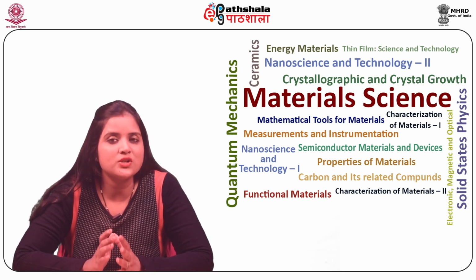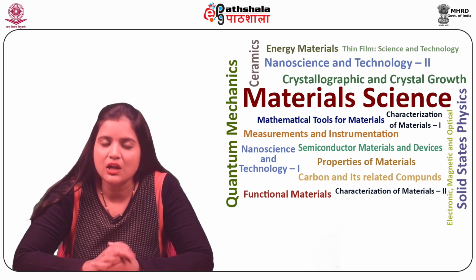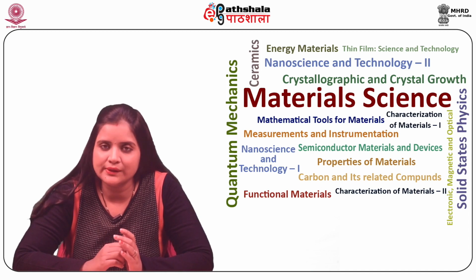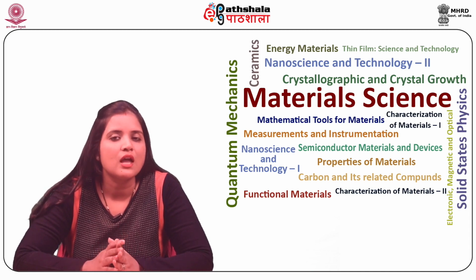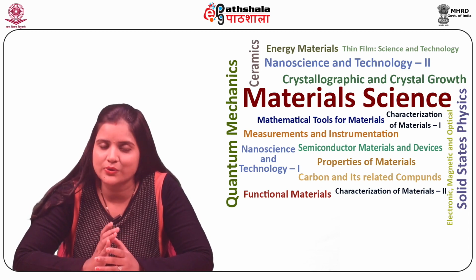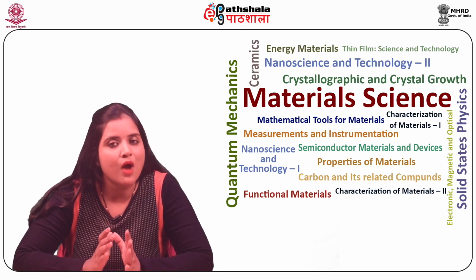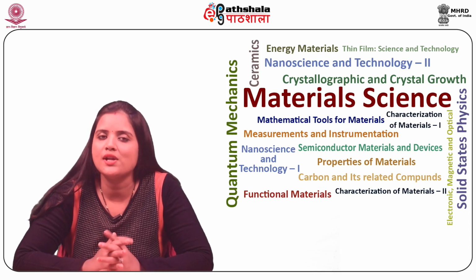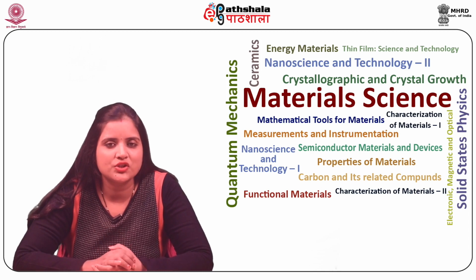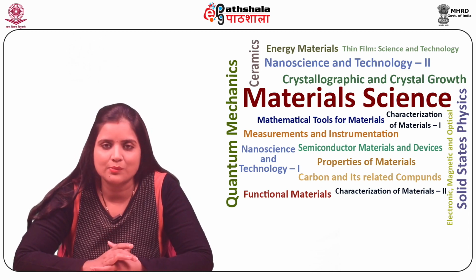Standardization of optical values of immersion oil has gained much interest in the past few years since it forms an integral part of the optical system of a microscope. Consistent values of immersion oil are essential to obtain good quality images from the microscope.